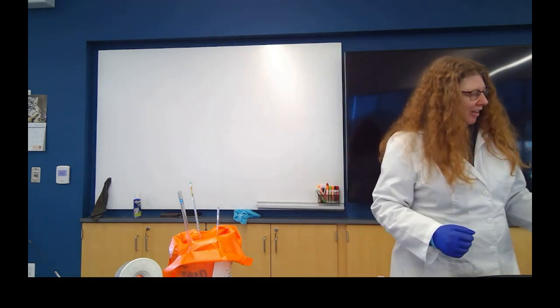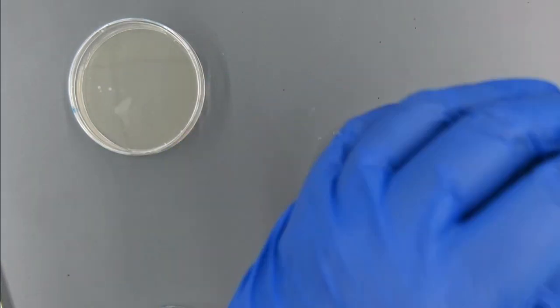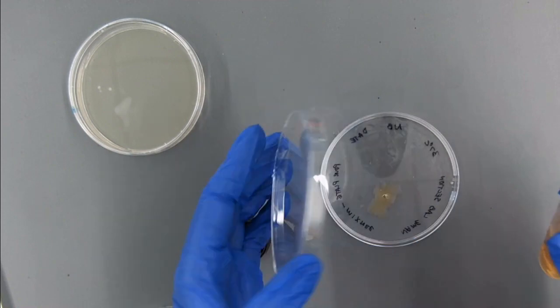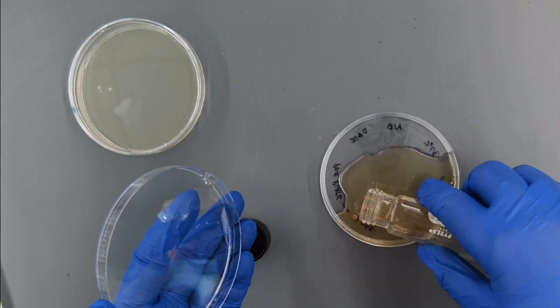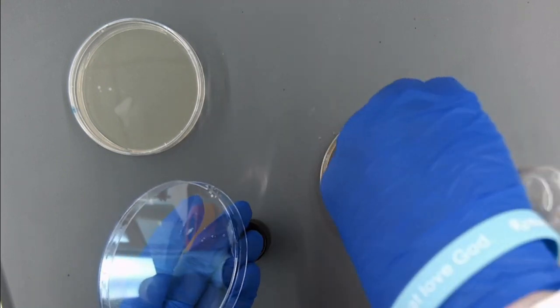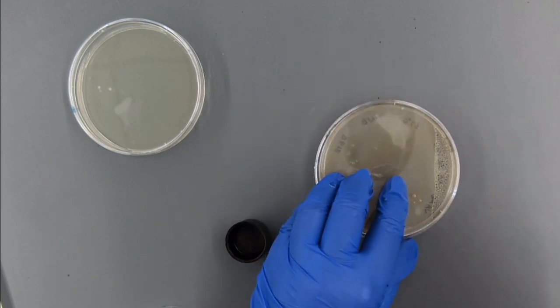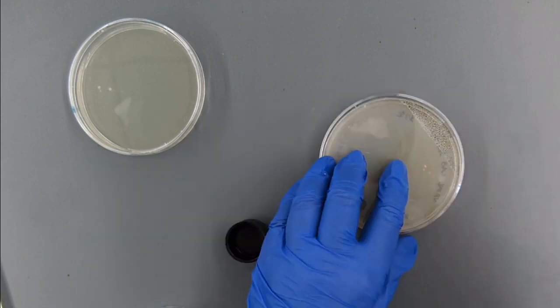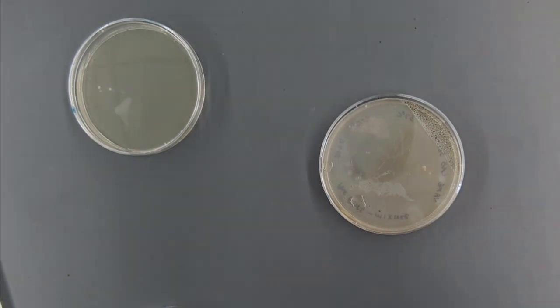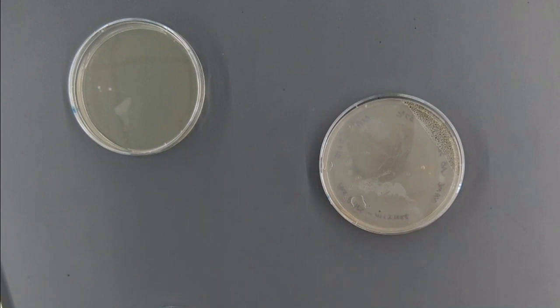Now, I'm going to take my culture of molten agar and I'm going to pour it into this plate. I'm going to pour the entire thing in. And then I'm going to gently swirl it so that the bacteria is mixed. Notice I'm being gentle. I don't want the agar to splash up on the sides. Then I'm going to let it solidify, and we'll incubate it at 37 degrees Celsius.